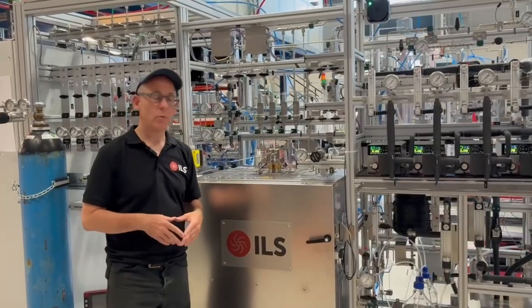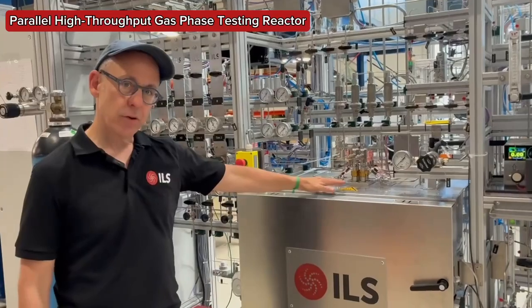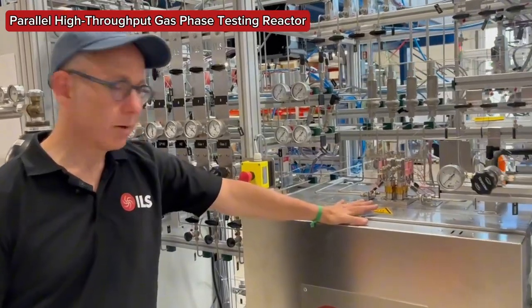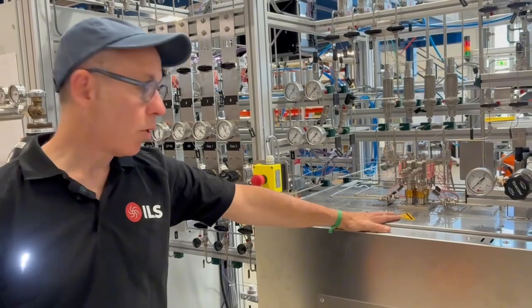In today's video, I'll be introducing you to one of our gas phase high-throughput testing units. This is pretty much our standard format that we use when we're doing parallel testing in fixed bed reactor format and have only gas phase products.